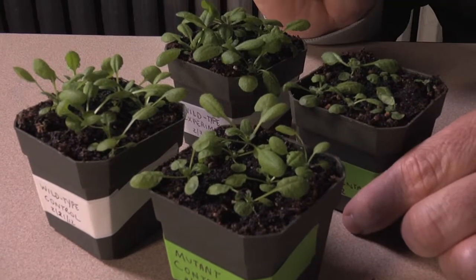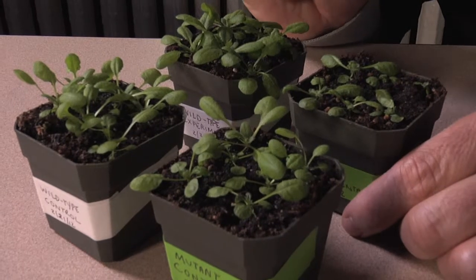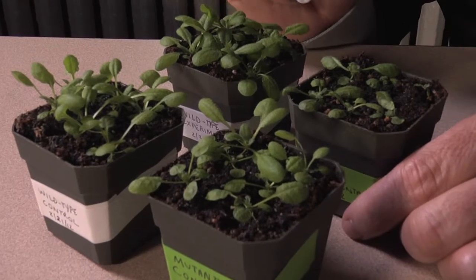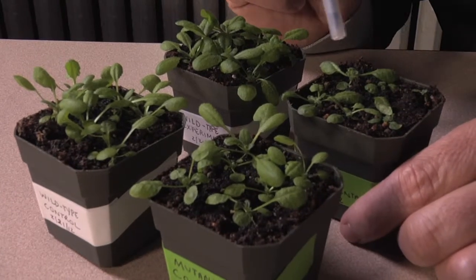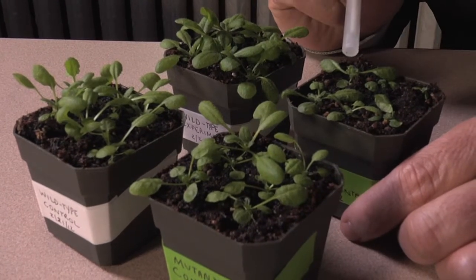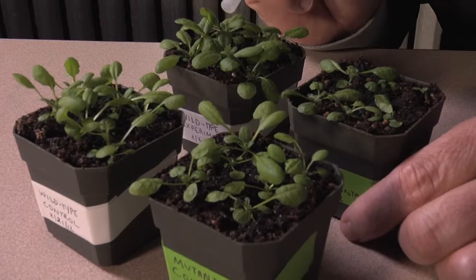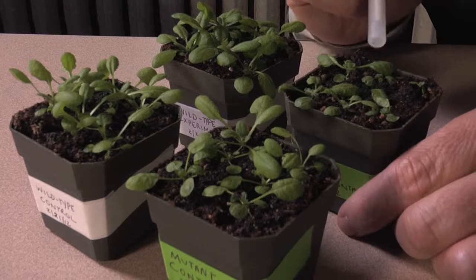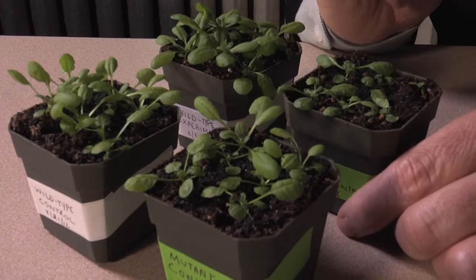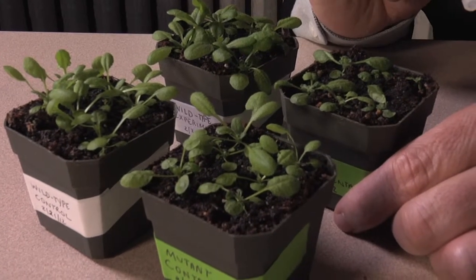If I look over here and say, well, is that just the amount of high light? I can see that there are no brown spots on the wild-type plants. They all look very healthy. And I can see that none of these are bolting like the wild-type are. In fact, they seem to be really struggling to get out any new leaves from the center of the rosette.